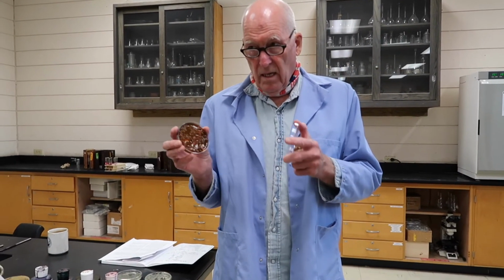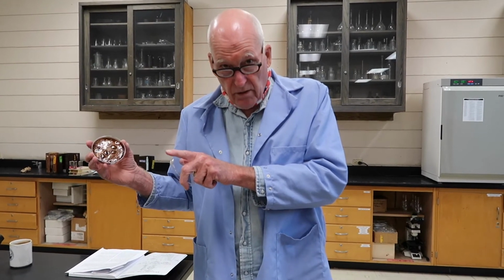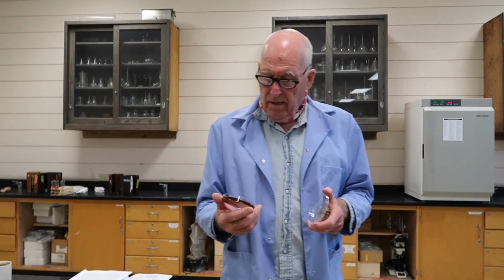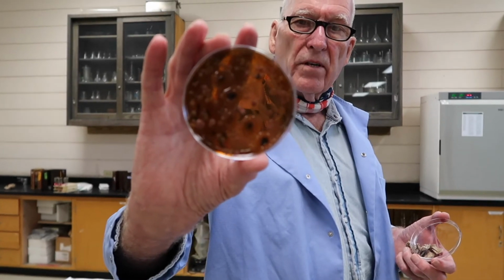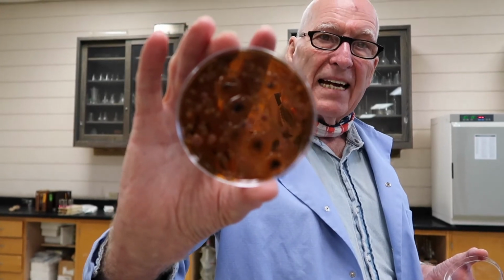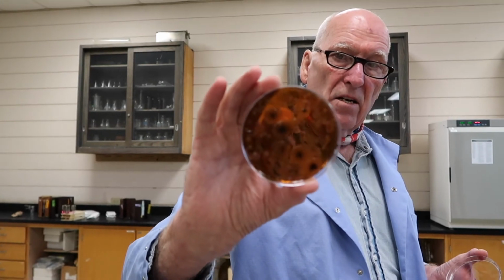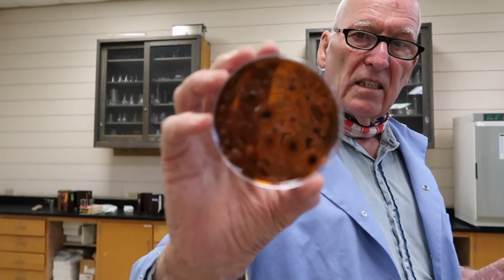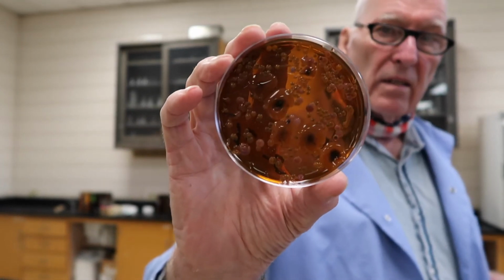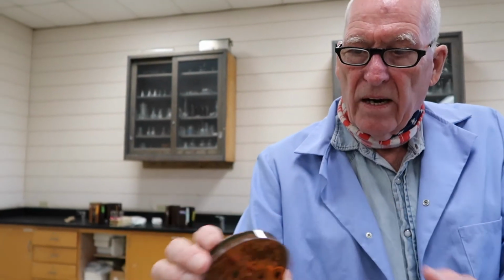Okay, the second part I want to talk about, because we're talking about growth at 21 or 22 degrees versus 18 degrees. Well, this is a shot of EMB. This is fecal coliform. Somewhere on the slides that I presented with you already, there are some lactic acid organisms and gram-negative bacteria. And this is EMB. It selects for gram-negative organisms like E. coli, Klebsiella, and stuff like that, and it's different strains of it.